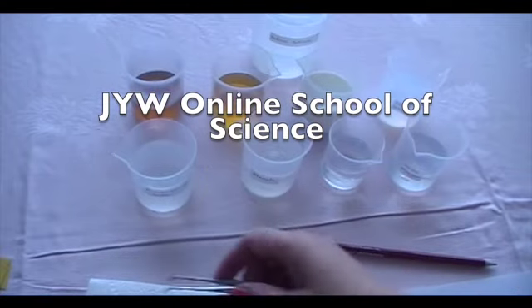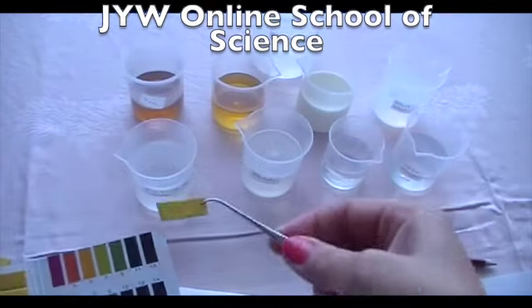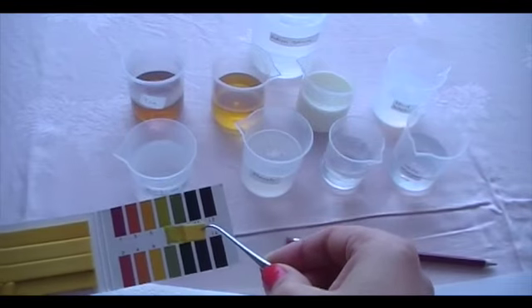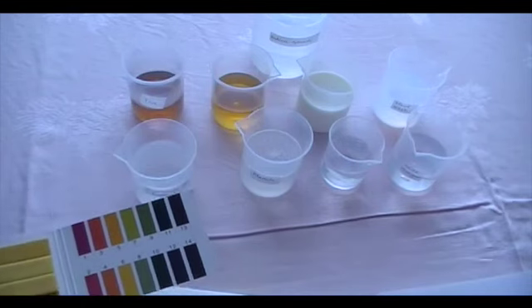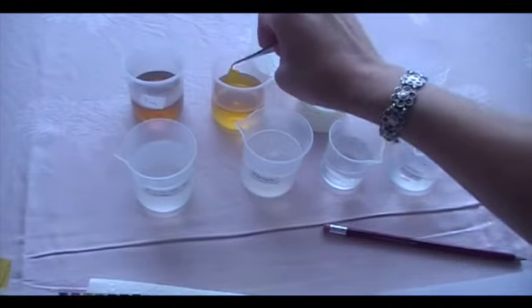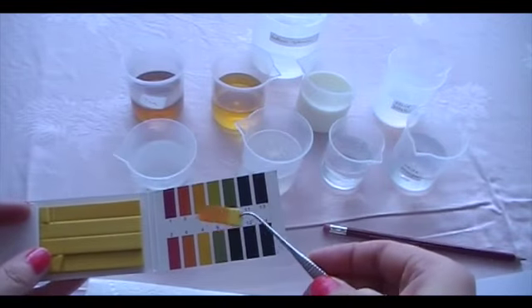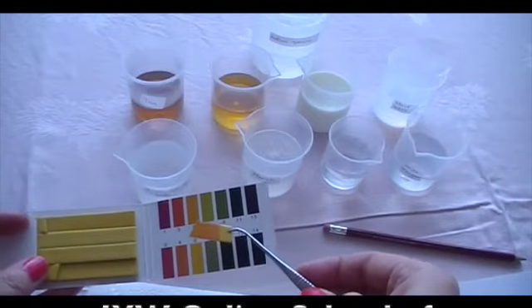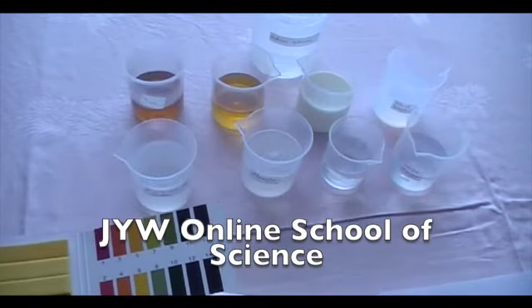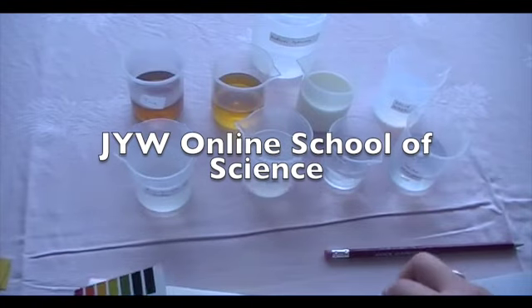Right, let's look at the tea. See the color of tea? I think it's pH 7. The color is pH 7. Tea, 7. And then let's look at apple juice. See the pH is pH 5. pH 4. Let's say pH 4. Apple juice. And then we have hand wash.